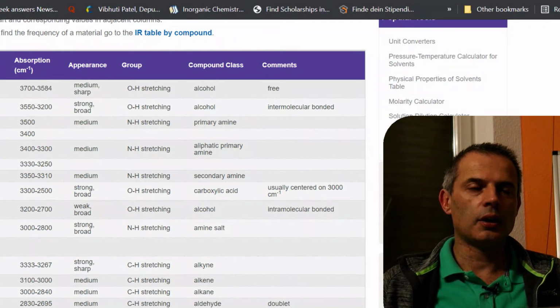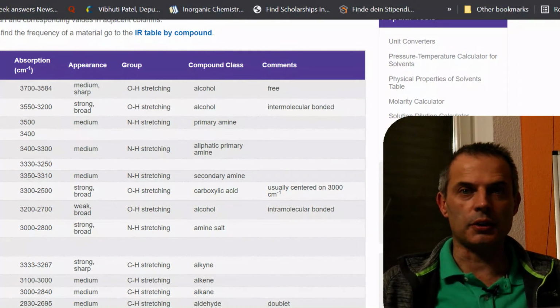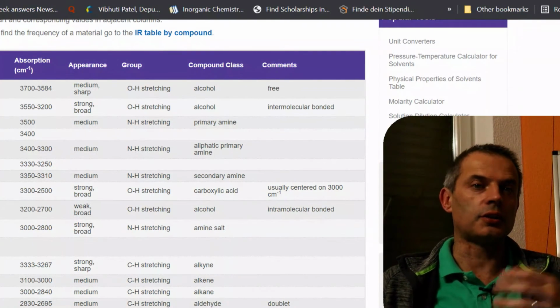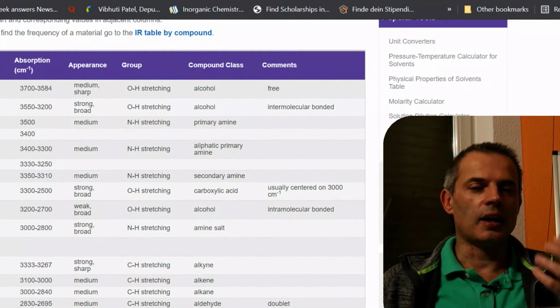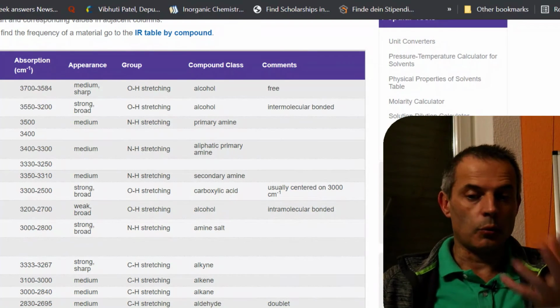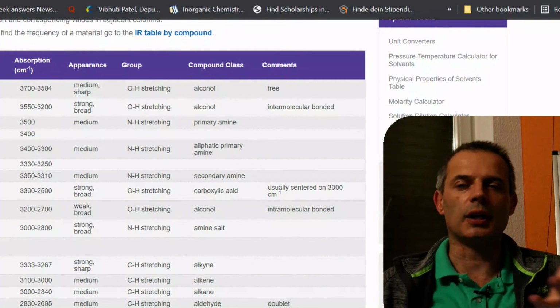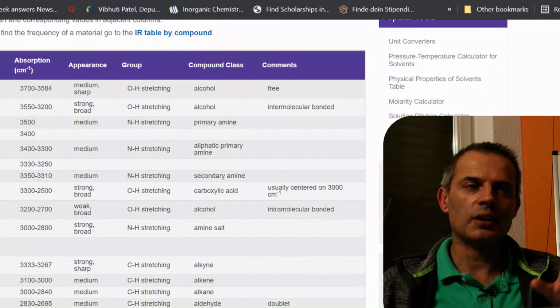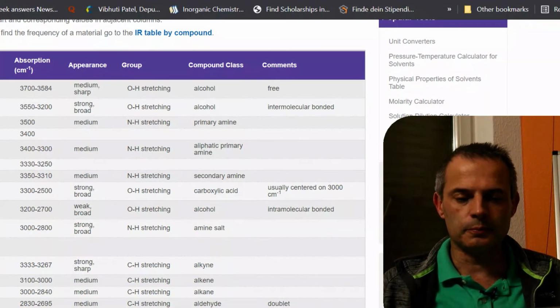So we'd know how many carbons, how many hydrogens, how many oxygens, how many nitrogens are in there, and we just don't know what order they're in, and the infrared tells us there's an alcohol, so that's what one of the oxygens is doing at least. And otherwise we would actually be cooking, so we would have a good idea, either we've made this or made something accidentally, but we know what the conditions are and what the chemicals are that we deliberately put in, so we can guess what it would be, which cuts it down a little bit.